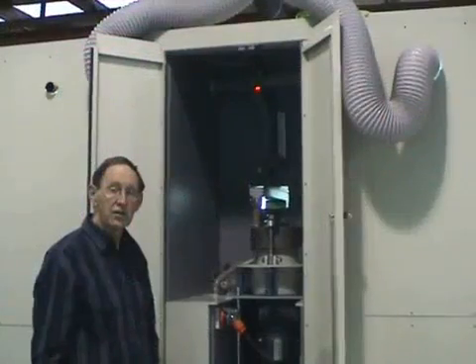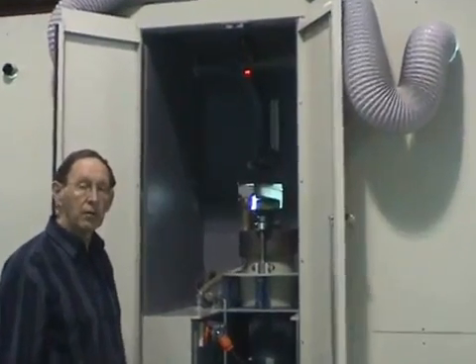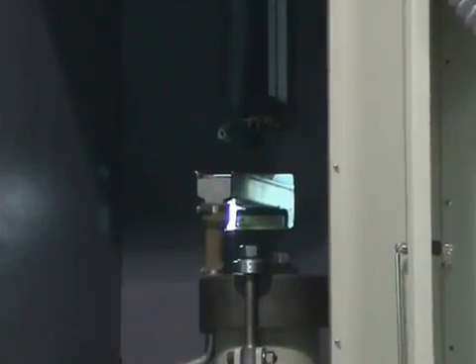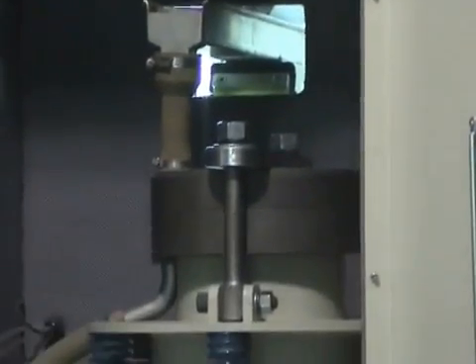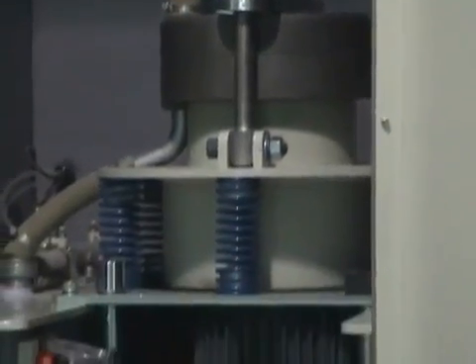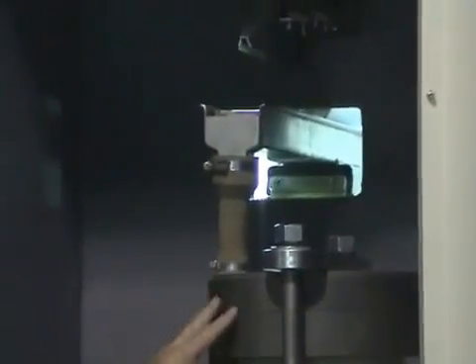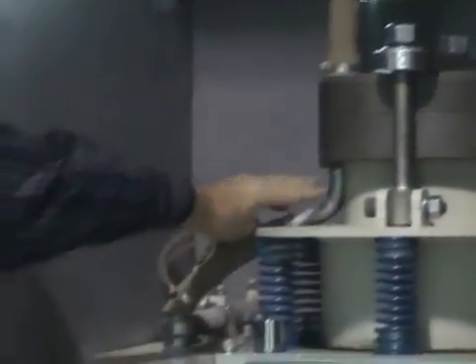In the pulverizing section of the system, the sample is pulverized by the Rock Labs Continuous Ring Mill, and this one has two stages for a fine product above 95% passing 100 microns. The sample enters the top from a feeder, passes through the two chambers of the mill, and exits down the exit pipe.